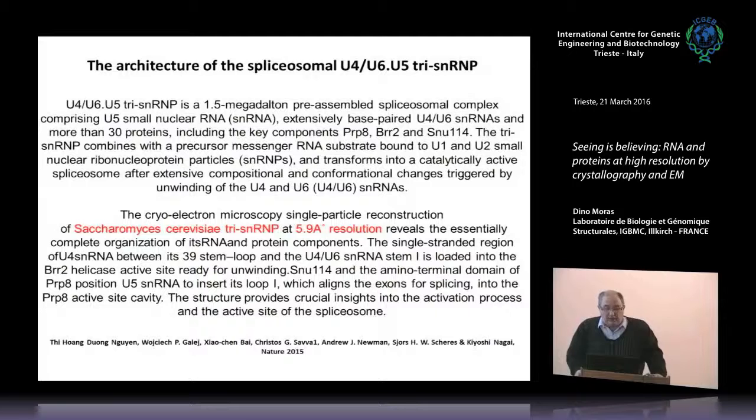Now, I will come back to a paper which was published a few months before, Nature 2015, by the group of Kiyoshi Nagai, working on the same origin, the Saccharomyces cerevisiae yeast spliceosome, again, this time at 5.9, let's put 6 angstrom.